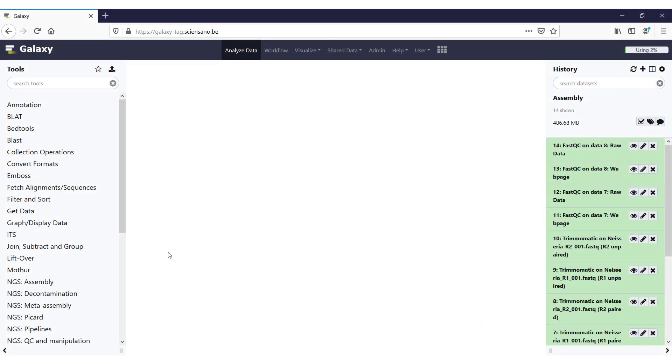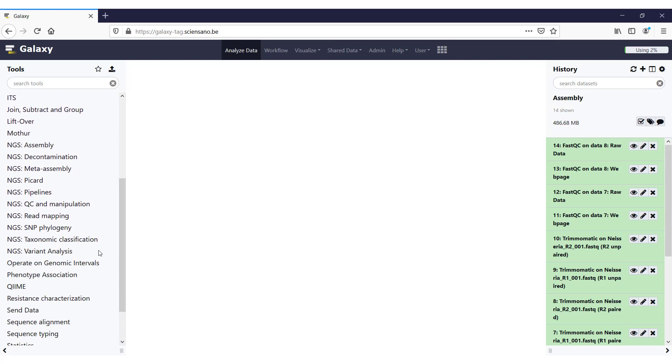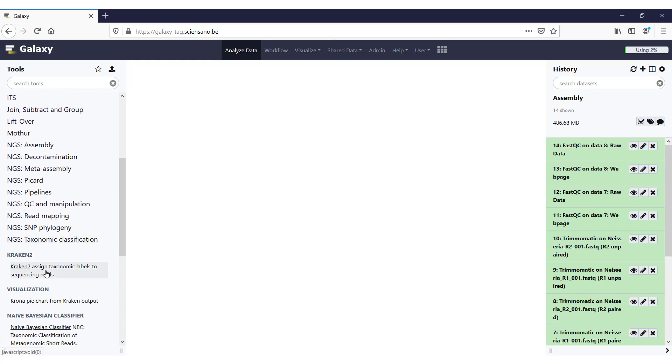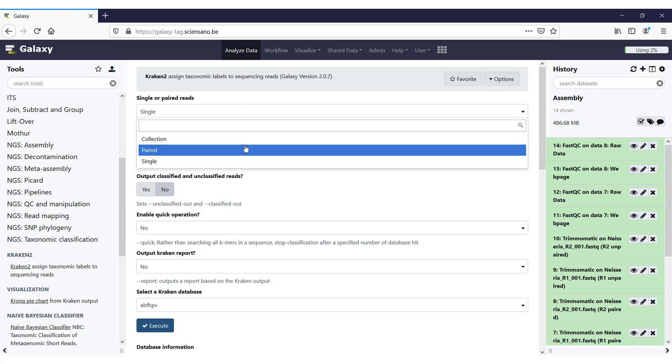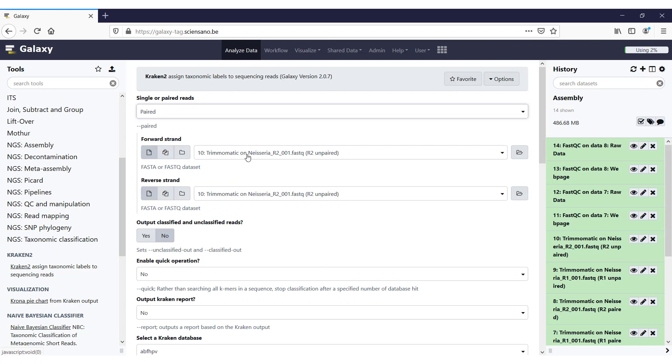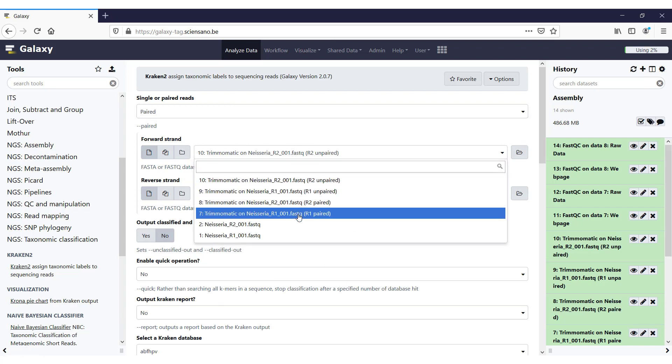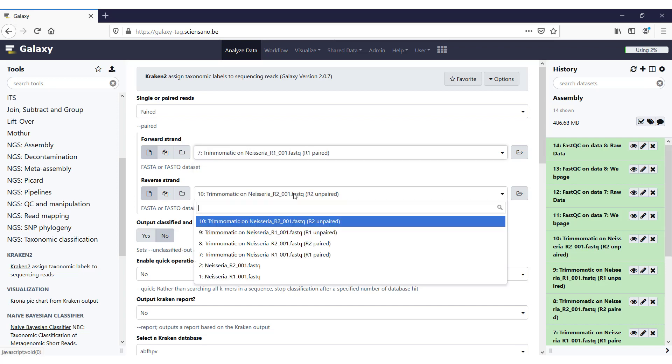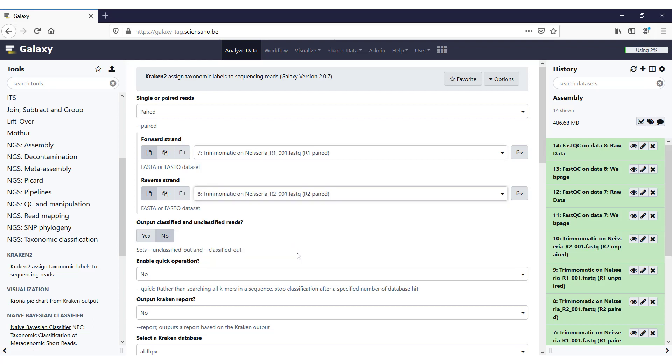You can find Kraken in Galaxy in the group NGS taxonomic classification, and here is Kraken 2, or you can always search for it in the search bar on top of the page. So for Kraken we need to select whether we have single or paired reads. In this case we have the paired reads that we used up to now. The forward strand will take the R1 paired reads, so the trimmed reads on the Neisseria dataset that we use, and for the reverse strand we use the R2 paired.